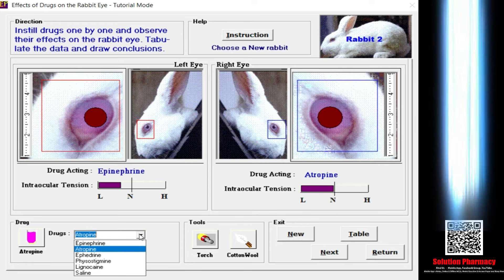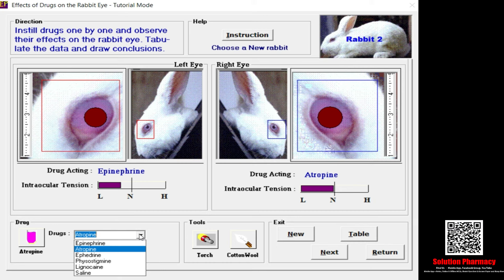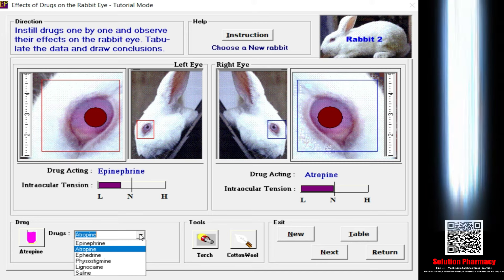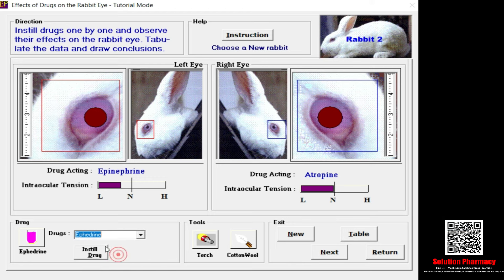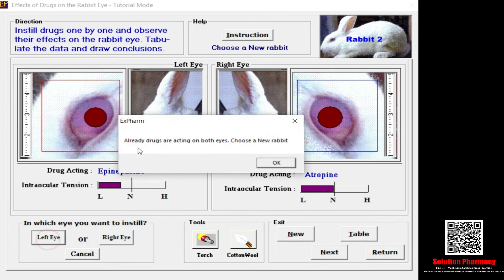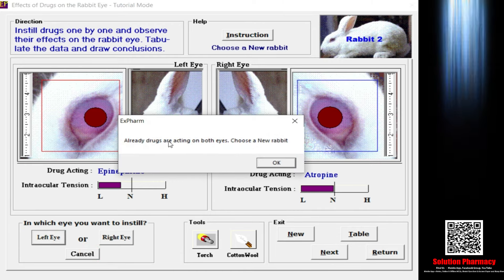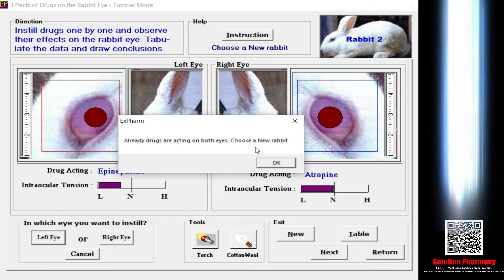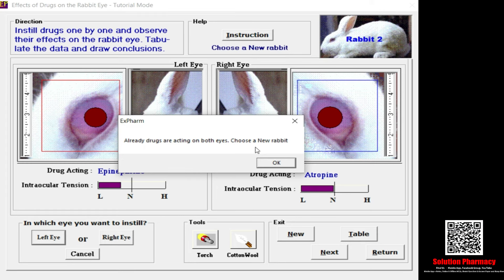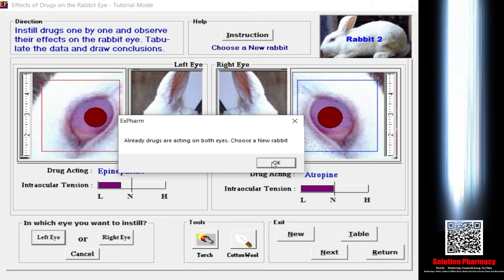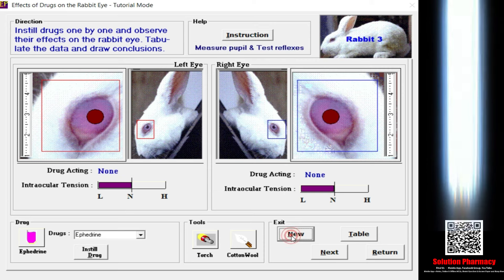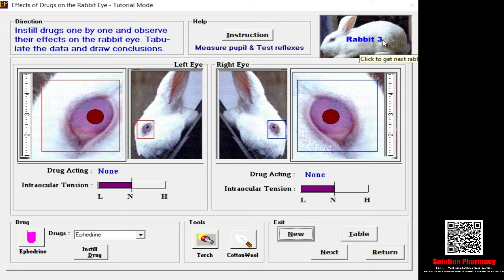When selecting a new drug, remember: if you have already instilled a drug into the eyes, the new drug will not show any action. The remark will say 'drug already acting on both eyes — choose a new rabbit.' Let me show you: I select epinephrine, instill the drug, select the left eye, but a pop-up appears saying drugs are already acting on both eyes. So I need to select the new button, and the rabbit count increases to rabbit three.